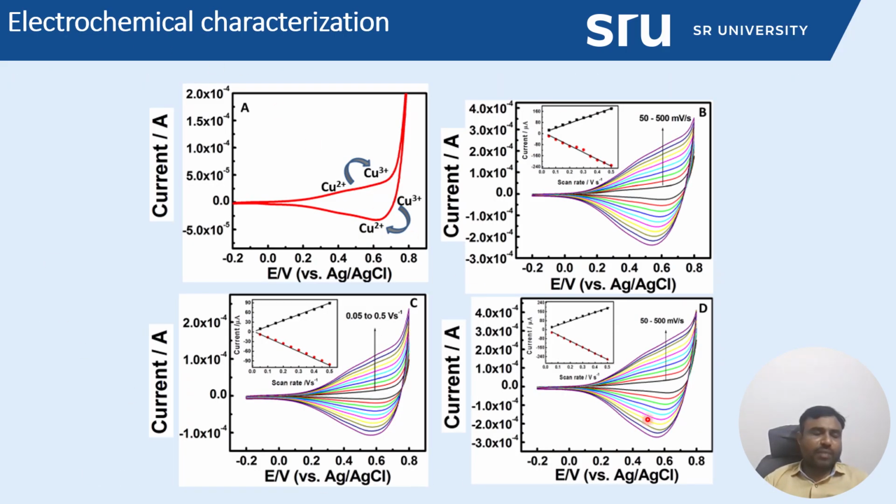So we have the morphology of the material clearly confirmed by FESEM and TEM, as well as XRD. From this physical characterization, we confirm the successful formation of copper sulfide without any other impurity. It is forming a pure copper sulfide hexagonal covellite phase, and does not involve any unwanted impurity or mixed phases.